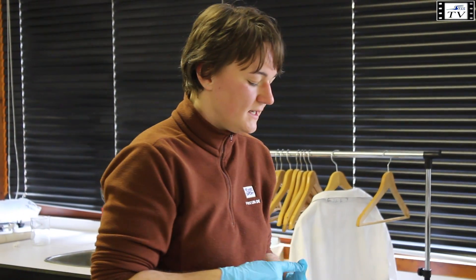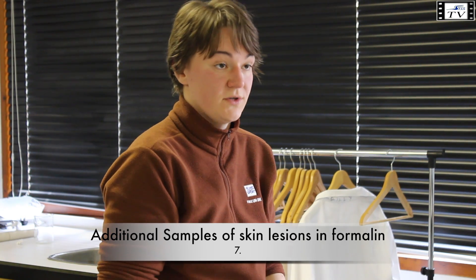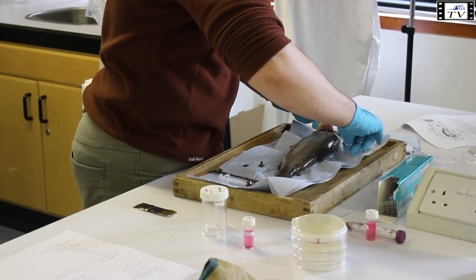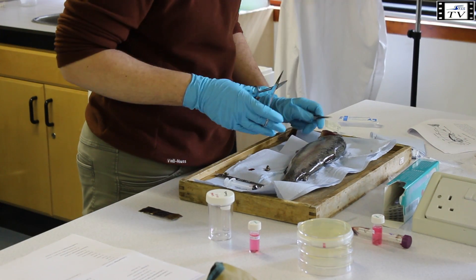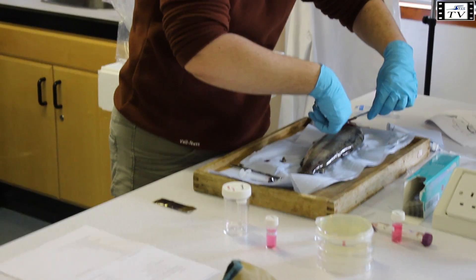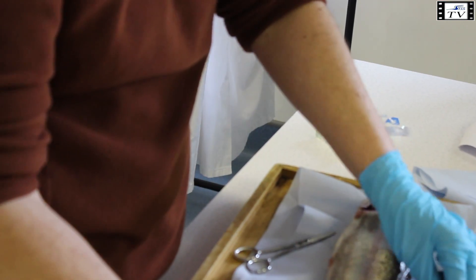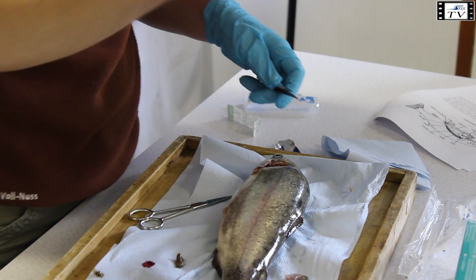For histopathology, sample from the skin lesion, and even if the operculum is not affected, I would still like you to sample one, because there aren't many references for what normal tissue looks like — it would be a good negative control. Cut out a skin sample and the operculum; these can be bigger than the electron microscopy and virology samples — up to about half a centimeter to a centimeter. Put them in formalin pots.